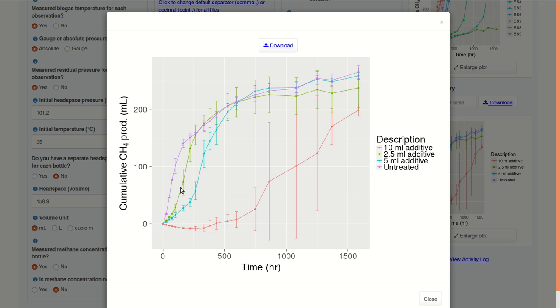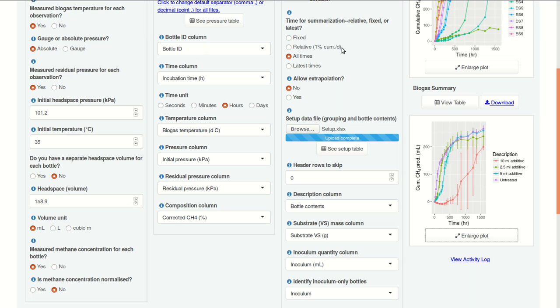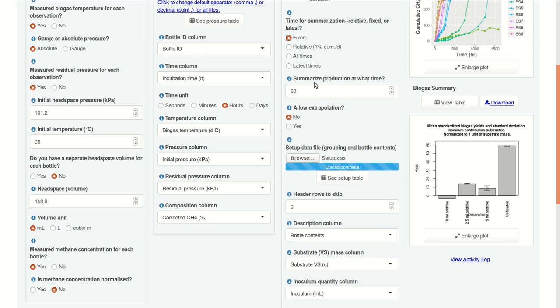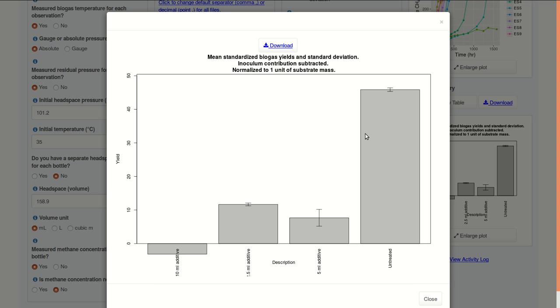We might look at this and this is how we want to look at an earlier time. So, for example, we could say, let's see what the results show after 50 hours. In that case, we'll select 50 hours. And here we can see, indeed, there's a very large relative difference between the untreated control and the three levels of the treated substrate. 10 milliliters of additive actually reduced methane production to a level that was lower than the inoculum-only bottles.